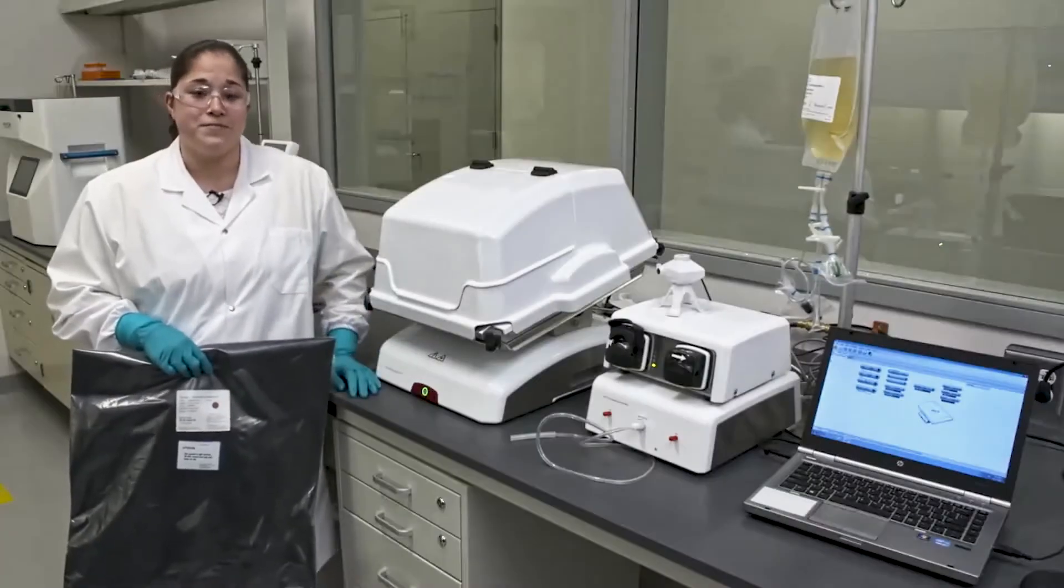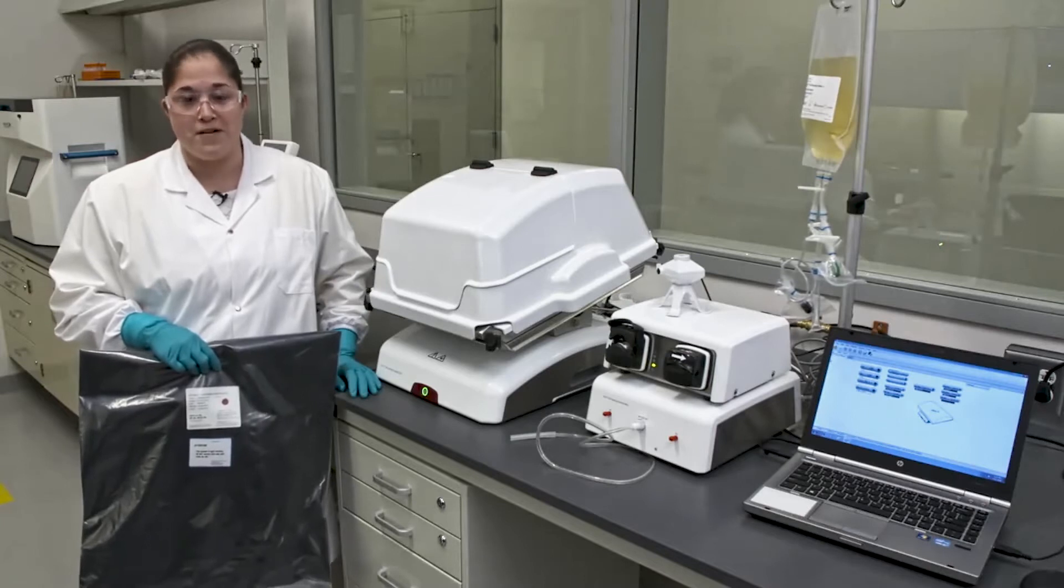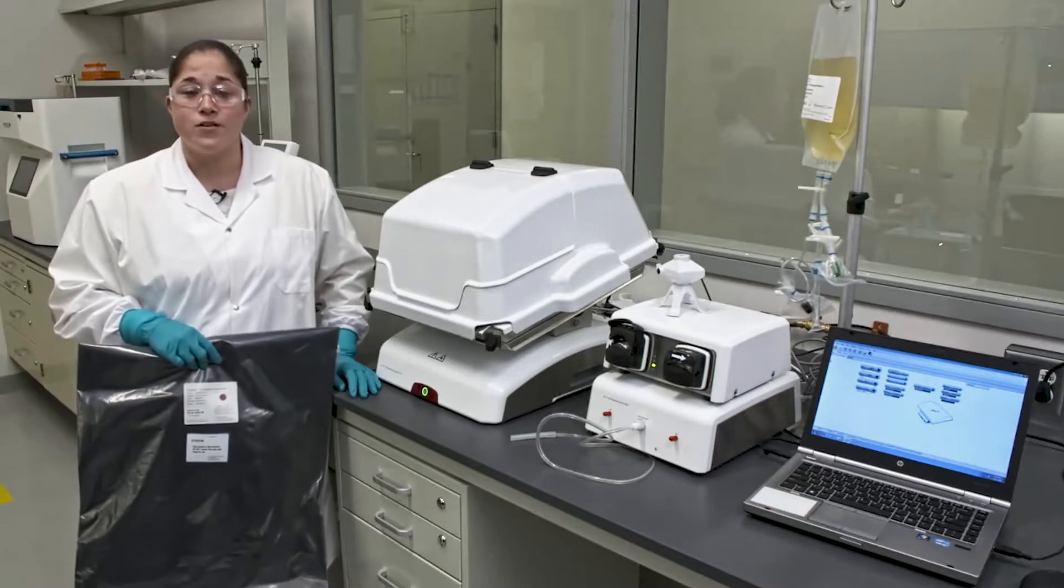The Zuri Cell Expansion System W25 delivers an automated, controlled expansion environment for the growth of cell therapies in volumes up to 25 liters across research, process development and manufacturing operations.